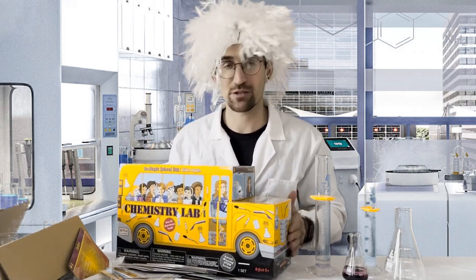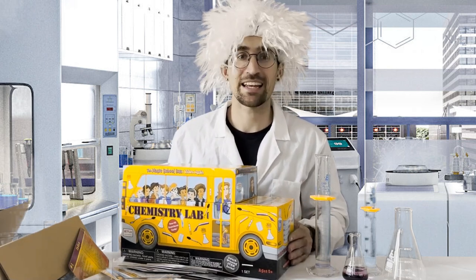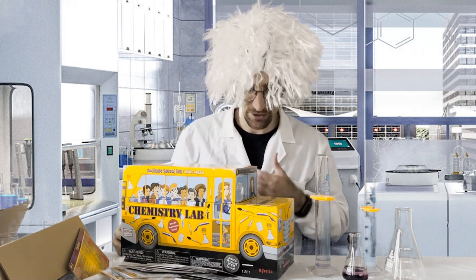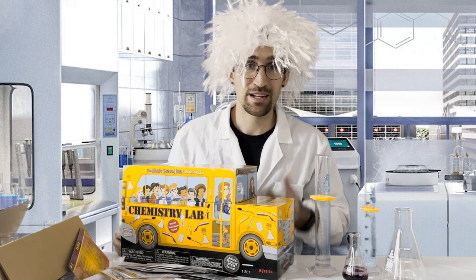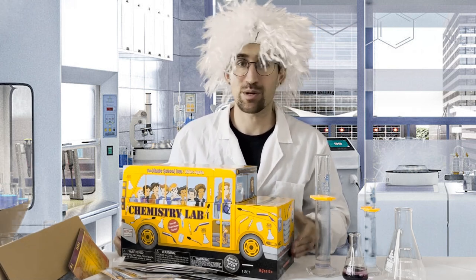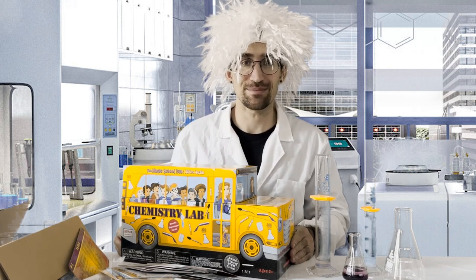Just like that, that concludes our overview of the chemistry lab kit from Scholastic featuring the Magic School Bus Rides Again theming. I hope you and your child or students can enjoy these fun experiments. For those ages five and up, if you're interested, you can learn about some other chemistry kits on the channel as well. We hope to see you again at teachkidschemistry.com.